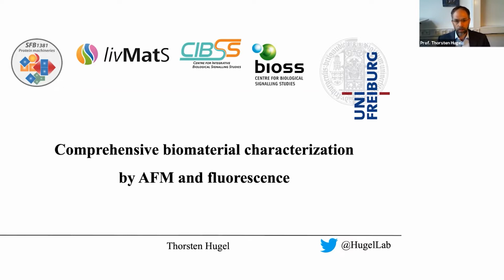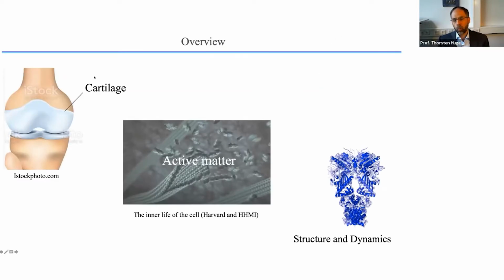So one is the different scales we experience. For example, if we look at cartilage, we heard a little bit about this, where we are on the millimeter or even centimeter scale, down to single proteins, where we are on the nanometer scale. And I will start with this because you got already a very nice introduction from Matthias Tchaikovsky this morning.